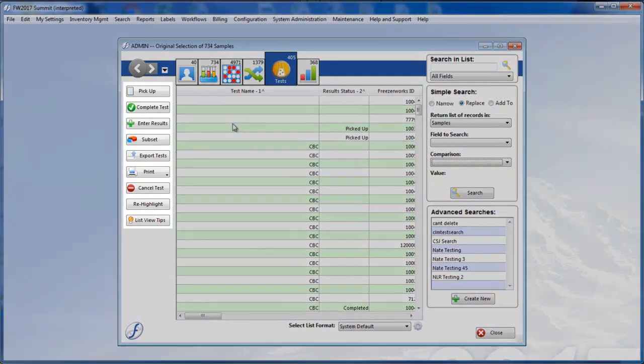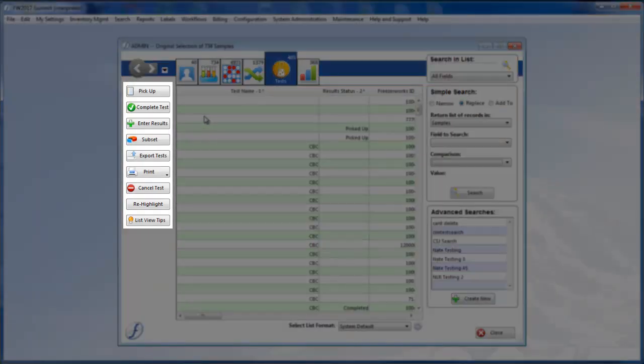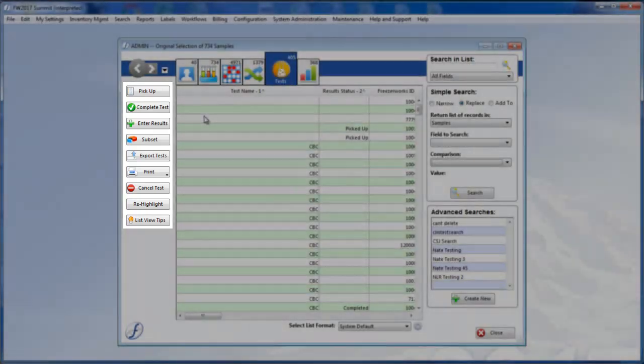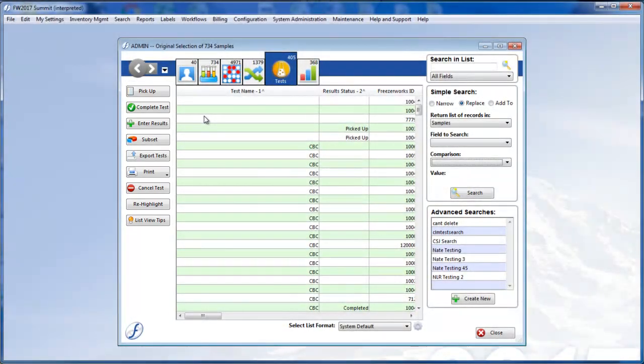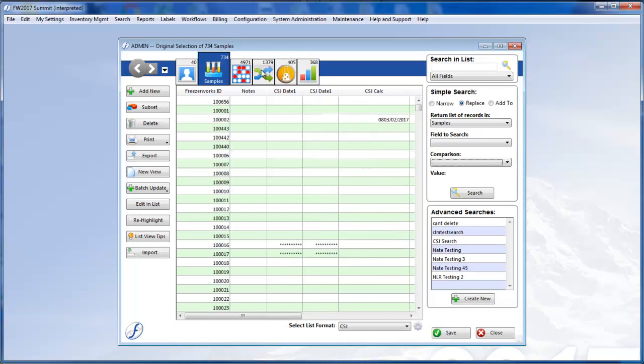Using the buttons on the left, you can pick up, complete, and enter results for tests. Above all, this new design will allow you to quickly see the inventory participating in selected tests.